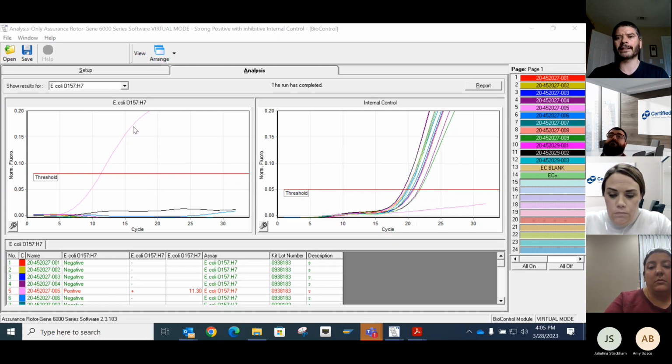So if this window is valid, you can see this. Like I say, you really don't see it often in E. coli, Salmonella. Listeria is where you'll see it most, but when the cycle, like I said, is around 10 plus or minus, you can see it. Sometimes I've seen it happen when it's close to 15, but that's pretty rare.